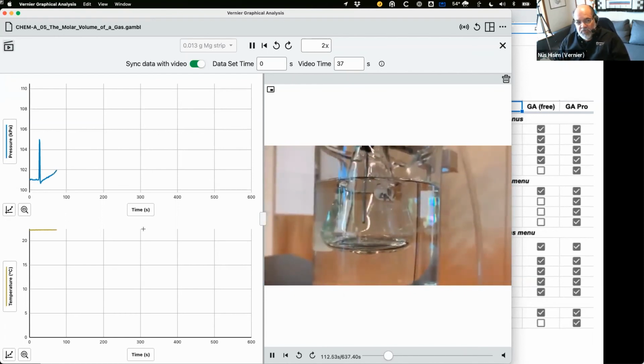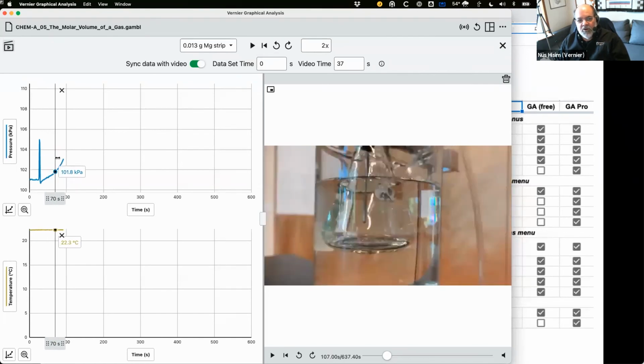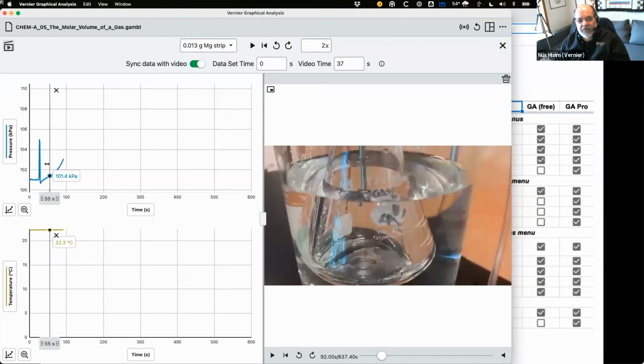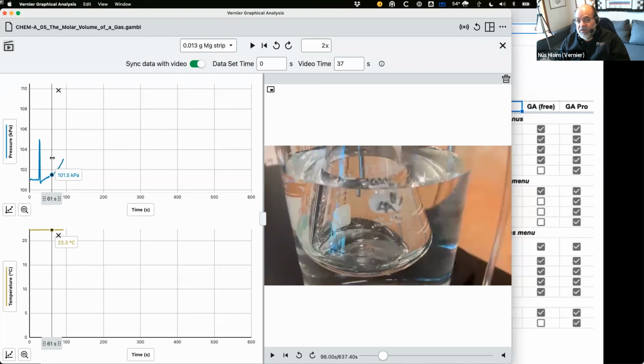All of that is reflected. This is all synchronized, and I don't know what happens if I stop and start, but it actually synchronizes to the video. So if you later go back and examine the data like I was doing earlier, it actually stays synchronized with the video.